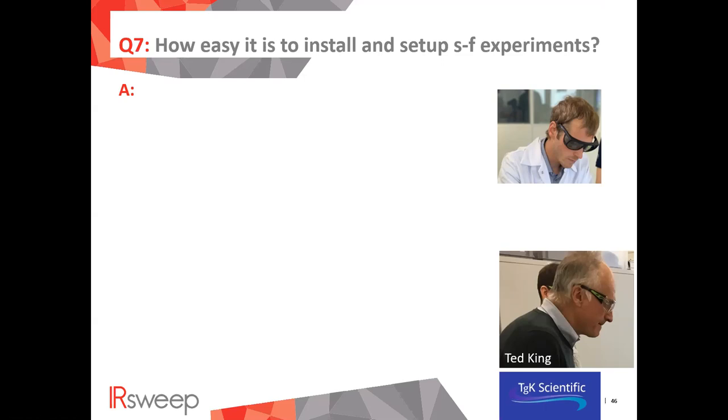I got another question from the chat, which I can probably answer myself directly: do you have any plans to try a fiber probe to interface to the sample? That's definitely very interesting. We've done some first measurements and, due to the strong lasers, we can probably go even to much longer mid-IR fibers. We don't know exactly how long, but we did already measurements up to 10 meters. So it's very, very promising results.